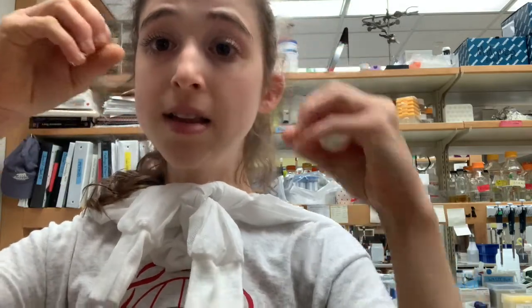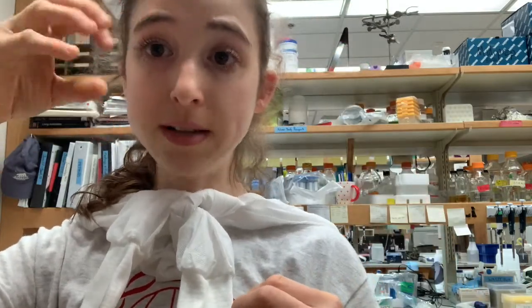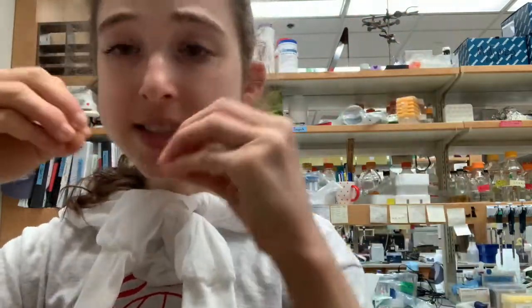So basically, the light that's given off by a fluorophore is a form of energy. This quencher is like, hey, I want that energy, and it steals it before this side can give off its light. And so these are on opposite ends of this probe. My arms aren't that flexible, sorry. But so you have the fluorophore and the quencher.